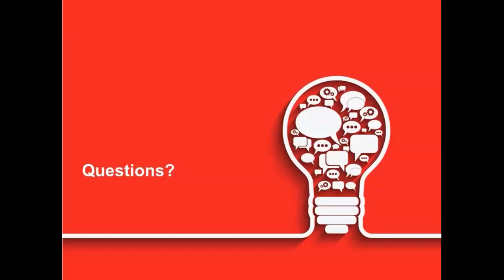And then other people have asked if the template will be available. I believe we'll be distributing that along with the recording. Yes, we will send these projects and the templates available to you. Remember that these templates I created with version 8.1, so they might not work in earlier versions. But everything that I showed you, the descriptive statistics, the data wizard, all of that can be done in any other version. So you can create your own template in any other version and save it.